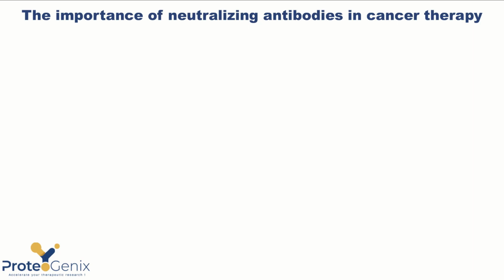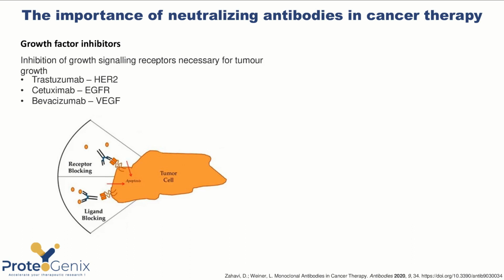Otherwise, although it is extremely important to have the right antibody repertoire within which to search for your therapeutic antibody, getting out the right antibody from your library is a separate task, which requires its own special know-how and protocols. In the case of anti-cancer therapeutics, in many cases, a specific blocking or neutralizing activity is desired for a functional therapeutic effect against the tumor, either to block the receptor or to block a ligand binding to a receptor.